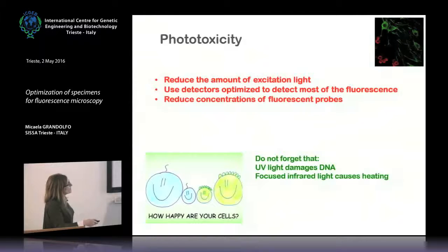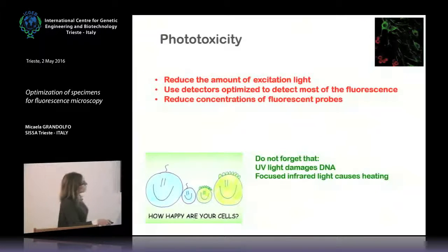Apart from phototoxicity, do not forget that UV light is very dangerous for the cells because it damages DNA and RNA. And also focused infrared light is dangerous because it causes heating in a very small local area of your sample.